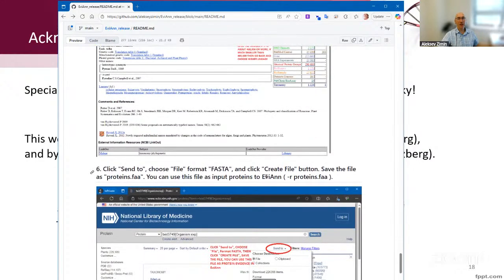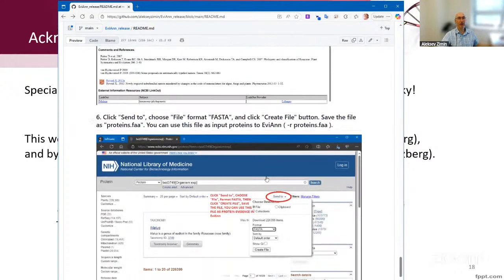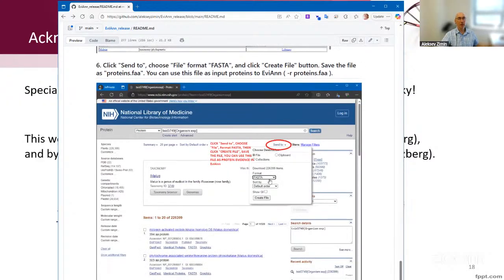Once you get to a number above 500,000, up to 1,000,000, you can just download these proteins from NCBI and use them. That's my recommendation, and that's what I do when I run annotation projects, and that gives me very good results. So 500,000 to 1,000,000 proteins, and just get them from the NCBI protein database by following the taxonomy tree up.